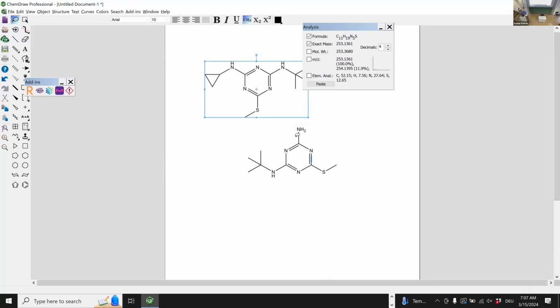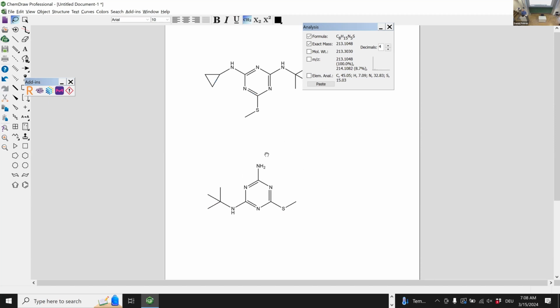So, wow. So CSI:FingerID actually got it right? So first of all, it ID'd Igarol, clearly the structure. And then what we already expected, that this could be a loss of this propane unit, seems also to be the case according to the in silico match from CSI:FingerID. So now, of course, this is still somewhat level 2, level 3 IDs, right? So this is not something I would claim is 100% true, but I think we have multiple layers of evidence. So I would be very positive about it.